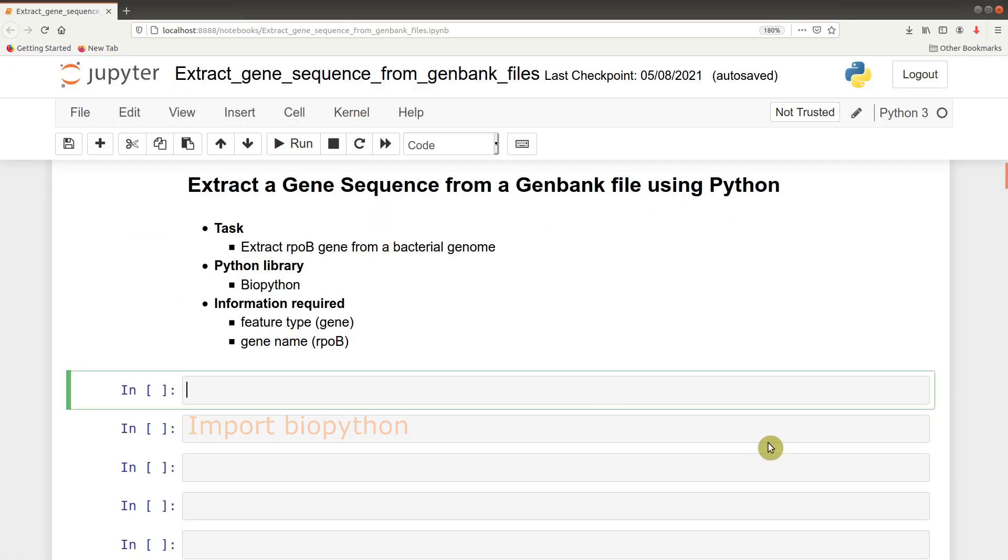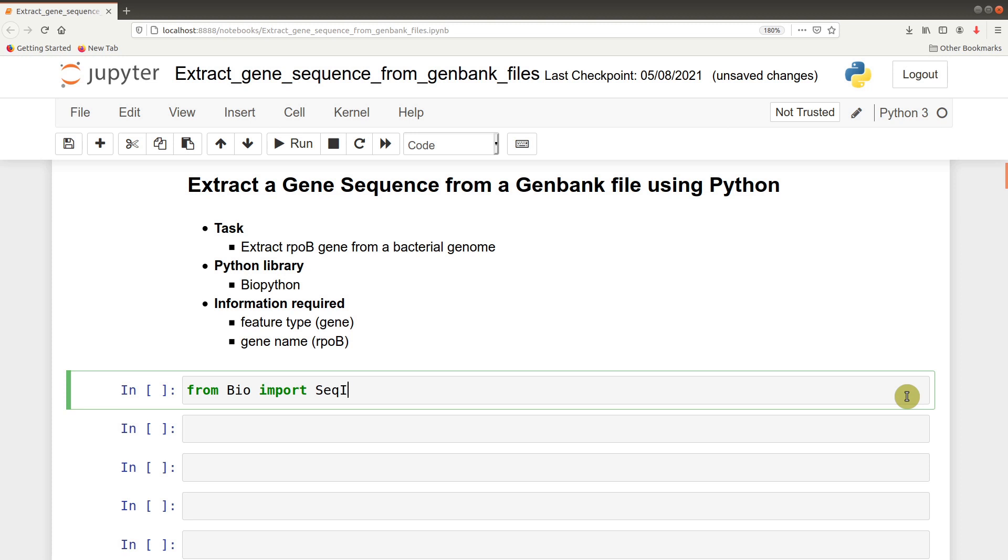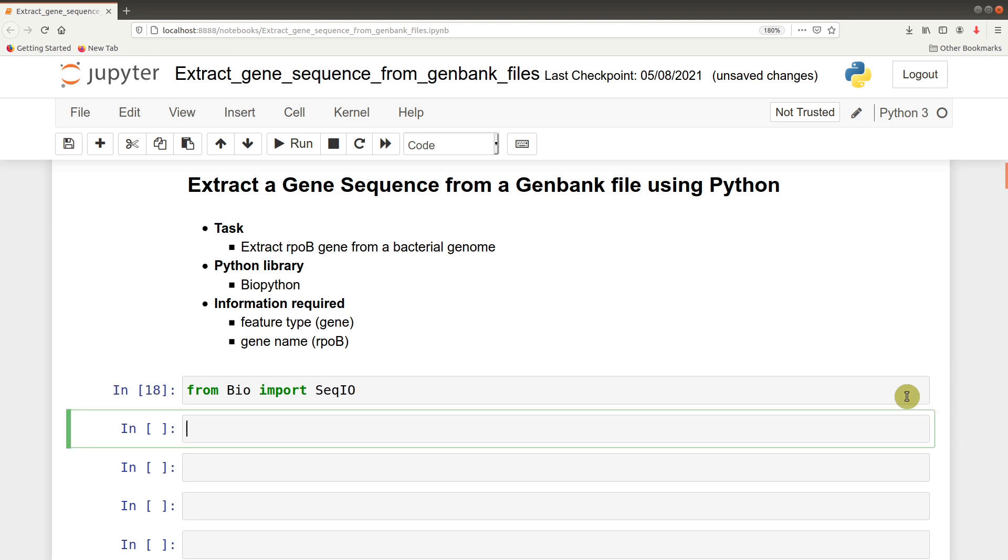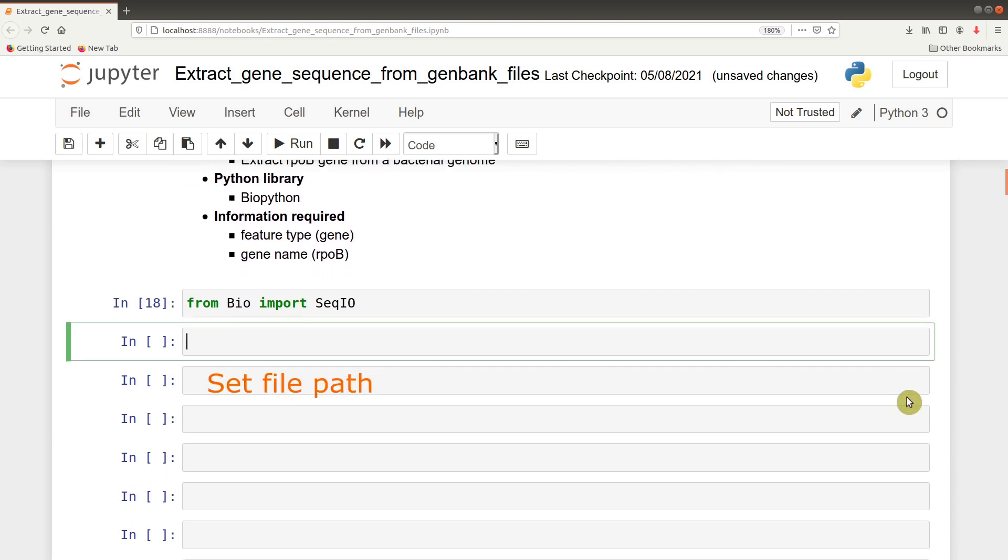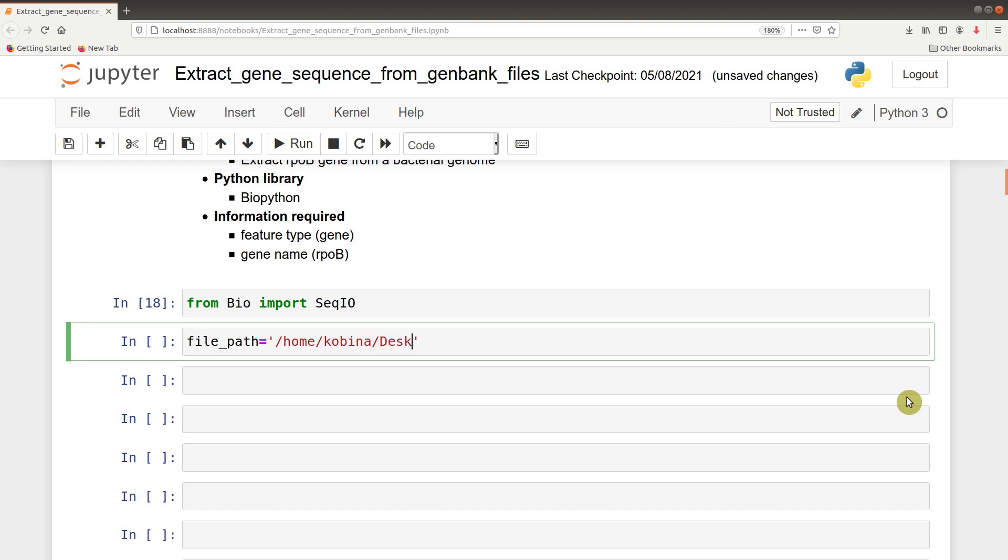The next thing after downloading the data is to import your Python library. So from Bio import SeqIO. After we're done with that, we now define the file path - where is the file saved? File path becomes, in my case, this becomes my file path. Yours is likely to change, so put the correct one there.